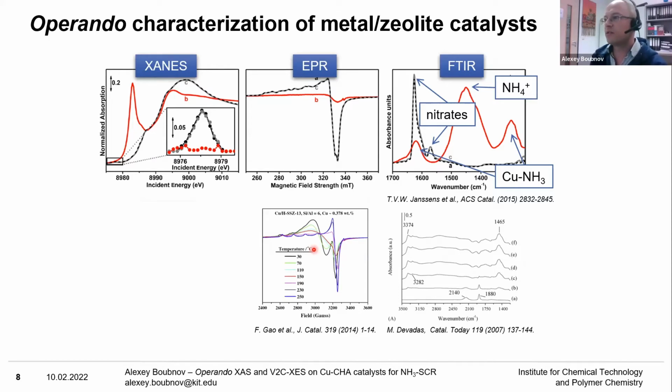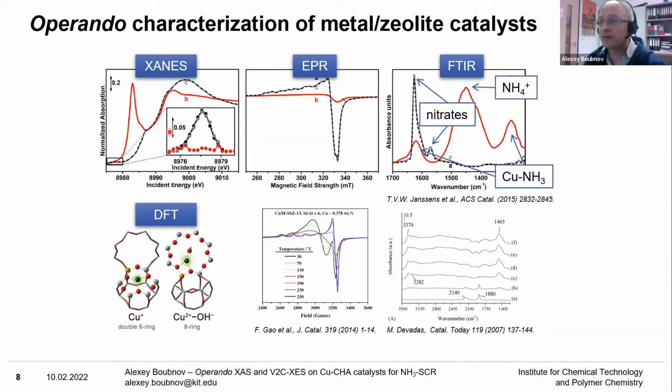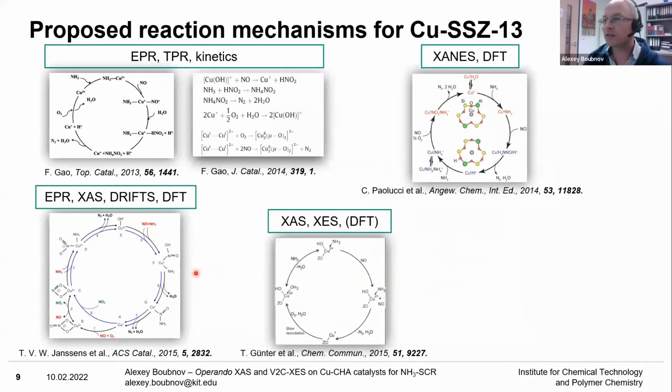And here I should mention also the preparation of the catalyst, since X-ray absorption spectroscopy probes the bulk, and we want to be surface sensitive because catalysis is a surface set of reactions. The catalysts for this work were designed in such a way that we have isolated sites. So all of the sites, all of the copper or iron or vanadium sites, are exposed to the reactant. Finally, we have DFT, which can computationally put the full picture of the catalyst, so the active site, the zeolite framework, and the reactants into perspective.